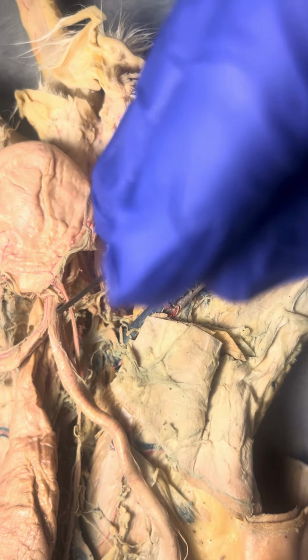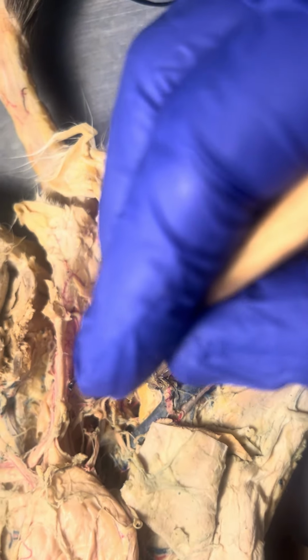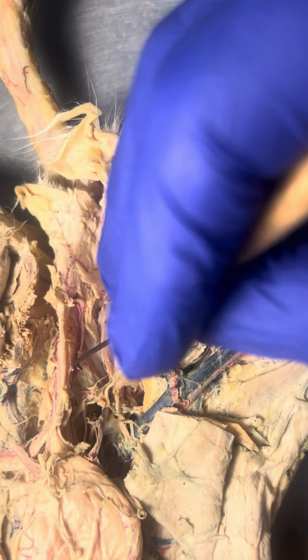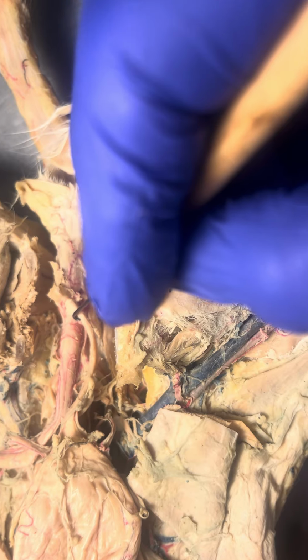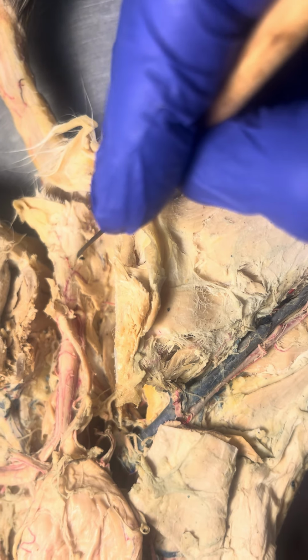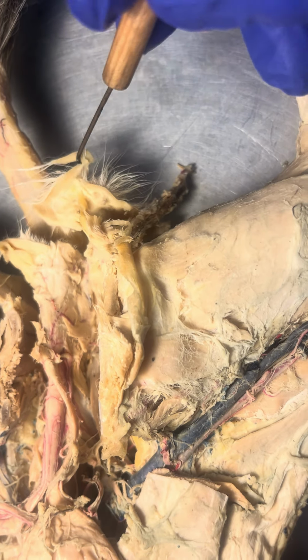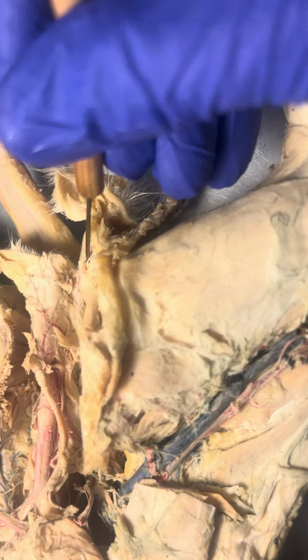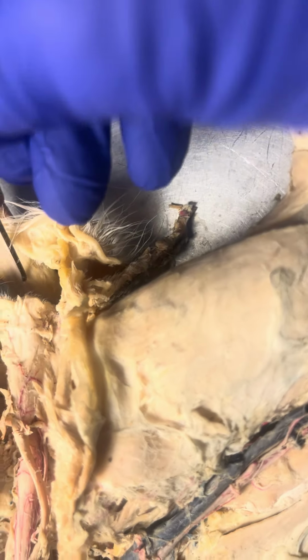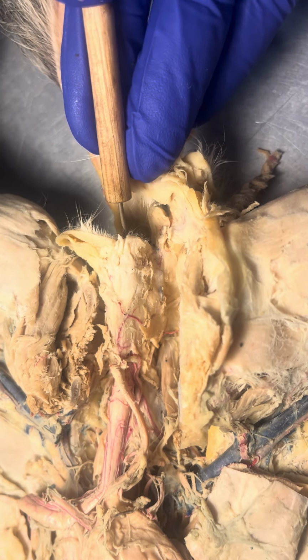So the uterine horn comes down to the uterine body, and then there's the cervix. This tube on the top is the urethra. Then there's the cervix, and then there's the vagina. And now here I can't see where they join, but the urethra and the vagina are going to join. And in the female cat, there's only one opening from the body. And here, that's here, right? And that one opening right here is the urogenital sinus.